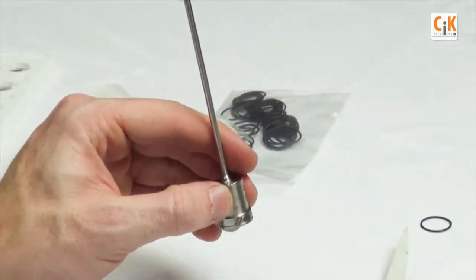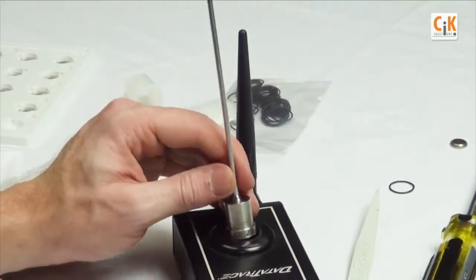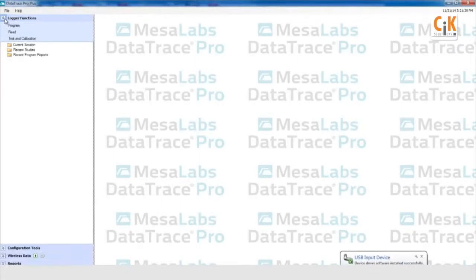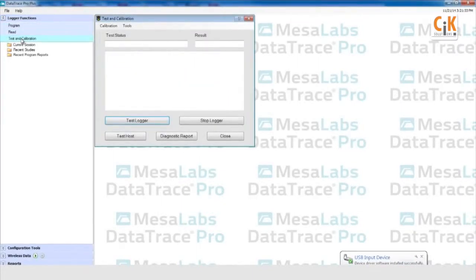Finally, place the logger in the PC interface. In DataTrace Pro, in the test and calibration window, click the new battery button under the tools menu. Follow the on-screen prompts to reset the battery and perform a test logger.